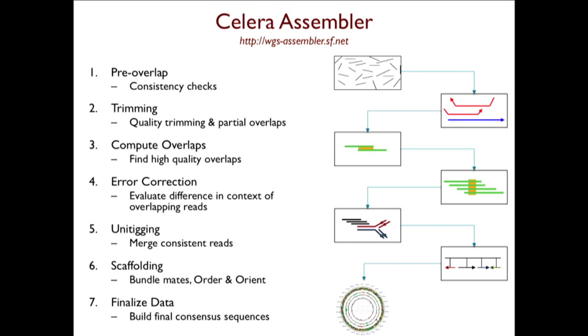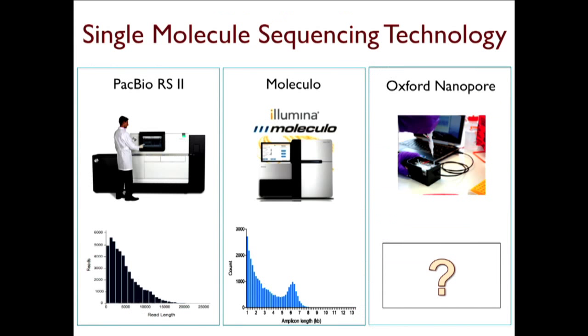There's some sort of technical differences I wasn't going to describe today. The main virtue of this is that it's totally compatible with long read sequencing. Now that there are some instruments and technologies available to generate reads, they're not 100 base pairs long, but tens of thousands of base pairs long. It becomes crazy to take a read that's 10,000 base pairs long and then chop it up into 50 base pair fragments. That's just a kind of crazy thing to do.